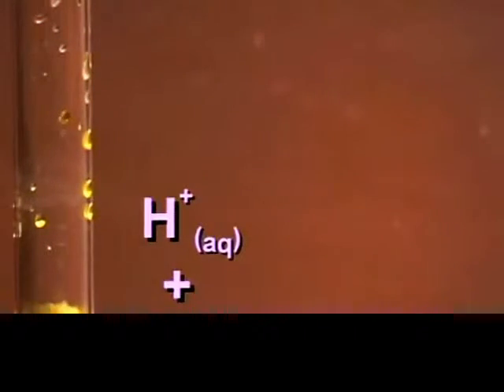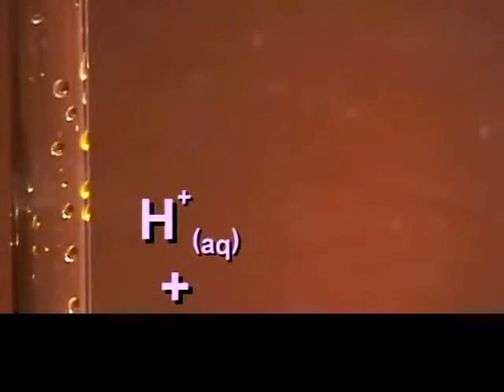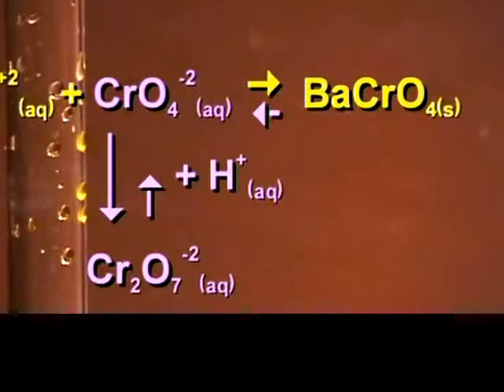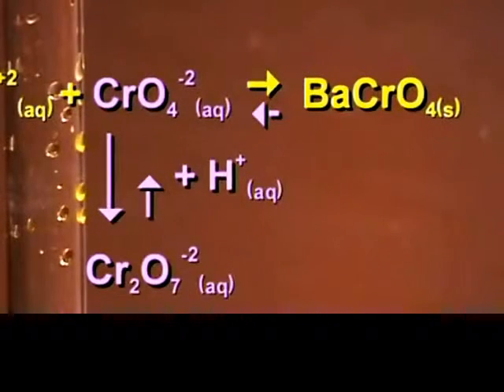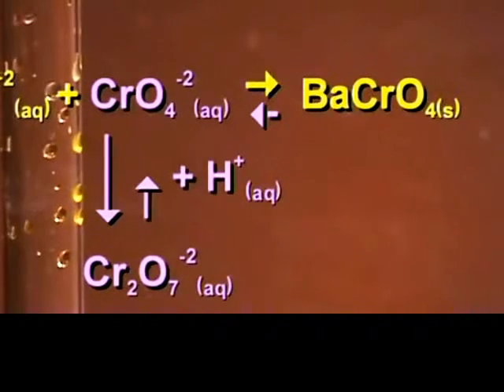If we take some of the solid barium chromate and add 6 molar nitric acid, we see that the solid goes back into solution and the solution turns orange. Adding the nitric acid provides a source of hydrogen ions. The hydrogen ions combine with the chromate ions and shift the equilibrium in the reverse direction to form dichromate, and the solution turns orange.